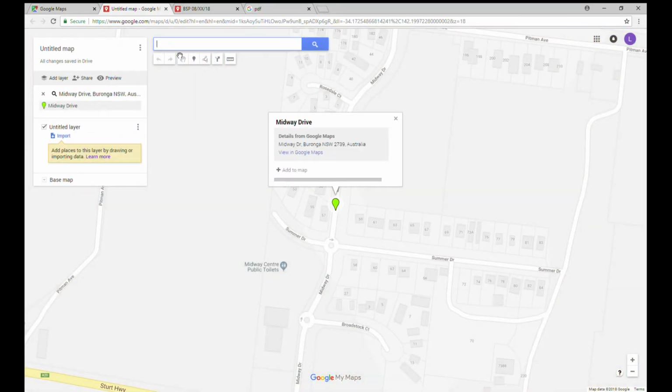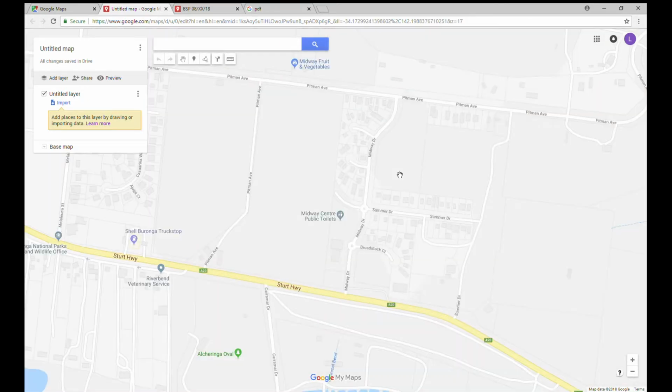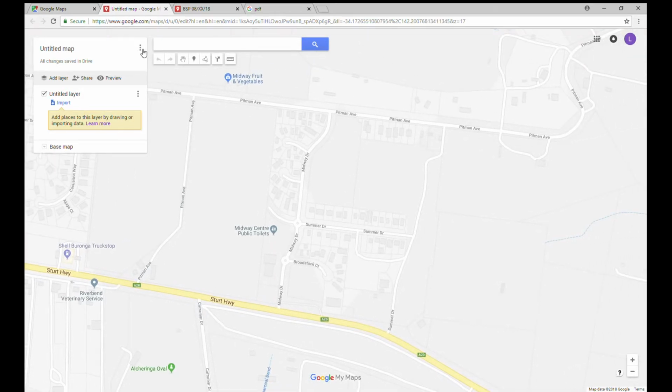Then, you can delete this point using the sidebar. Now, zoom in or out to get an optimal view of the entire water system. Then, you can click on the map options in the top left corner and set default view to save this orientation. Also, you can change the base map depending on if a map view or a satellite view is better for your system representation.